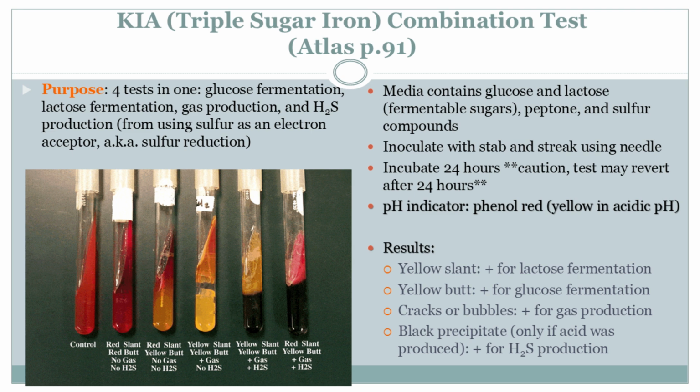Exactly. And as for ferric sulfate, well, that one helps us detect hydrogen sulfide. Hydrogen sulfide, that rings a bell. It's a byproduct that some bacteria produce. And if they're making it, we'll see this black precipitate forming in the agar. It's pretty cool to see. Wow, it's like we're setting up this whole buffet for the bacteria and then spying on their dining habits. That's a great way to think about it.